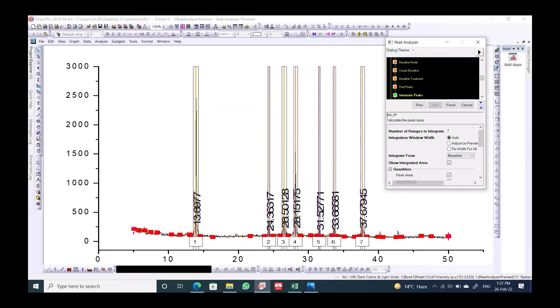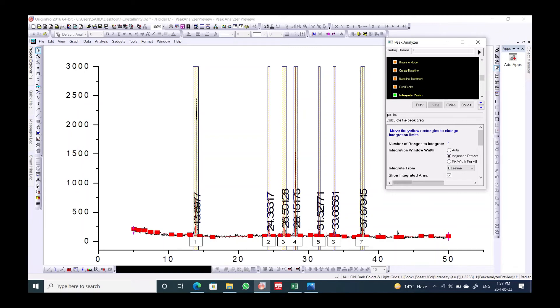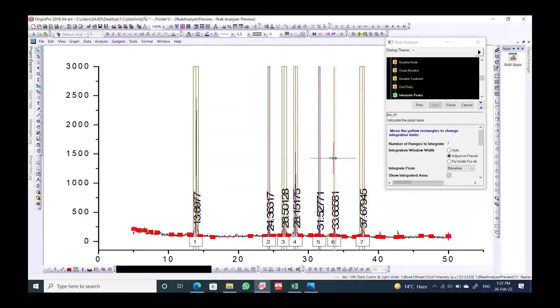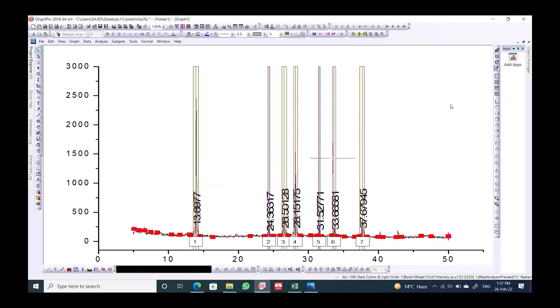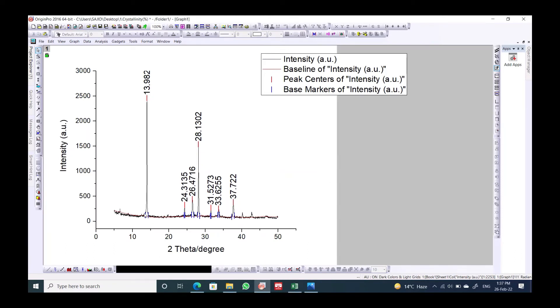If you feel that the area under the peaks is not suitable, you can modify it by clicking Adjust on Preview. You can make a peak a little wider or adjust its shape. Play around until it looks right, then click Finish.